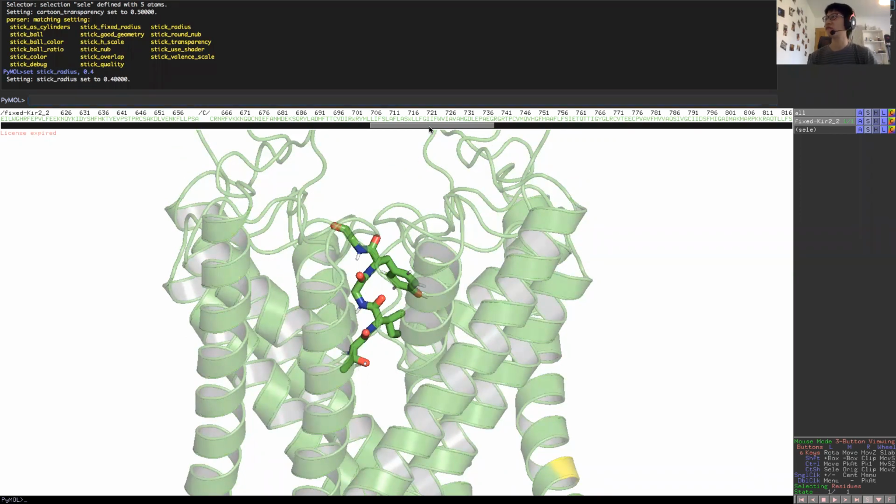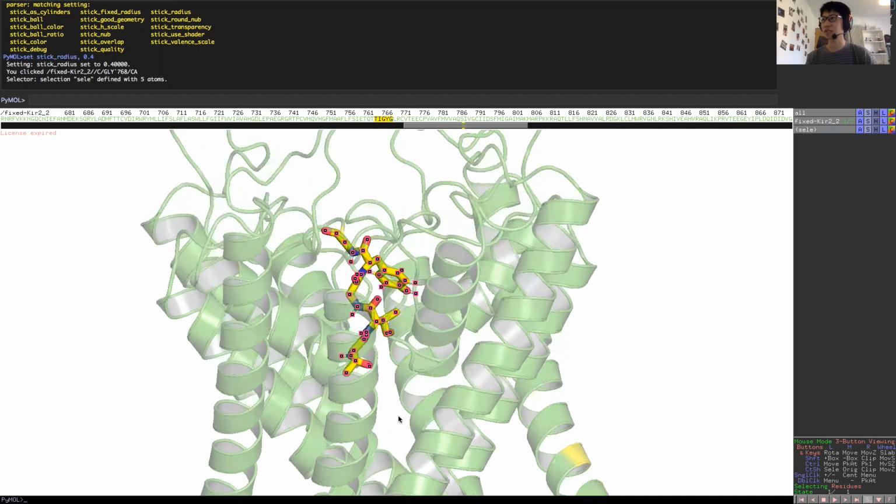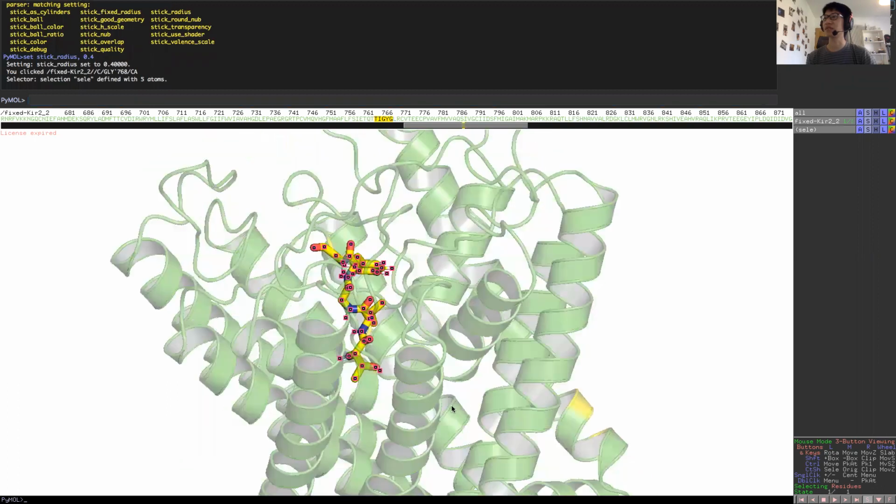Of course, if I start using this sequence tab, I can play around with it in a lot of ways. So I can shade it and give it some color. I can now have it in yellow or something, so it stands out from the rest of my molecular structure.